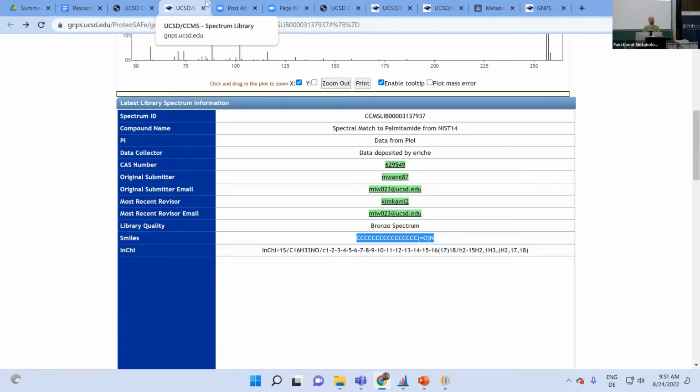I would base it on some ground truths you have. So for example, you have 2 authentic standards in there, then you know they're there, and you want to make sure that we identify them. So in our case here, cocaine was actually an internal standard. I spiked in a mixture of a couple of drugs because we had them available as an authentic standard mix in the lab.